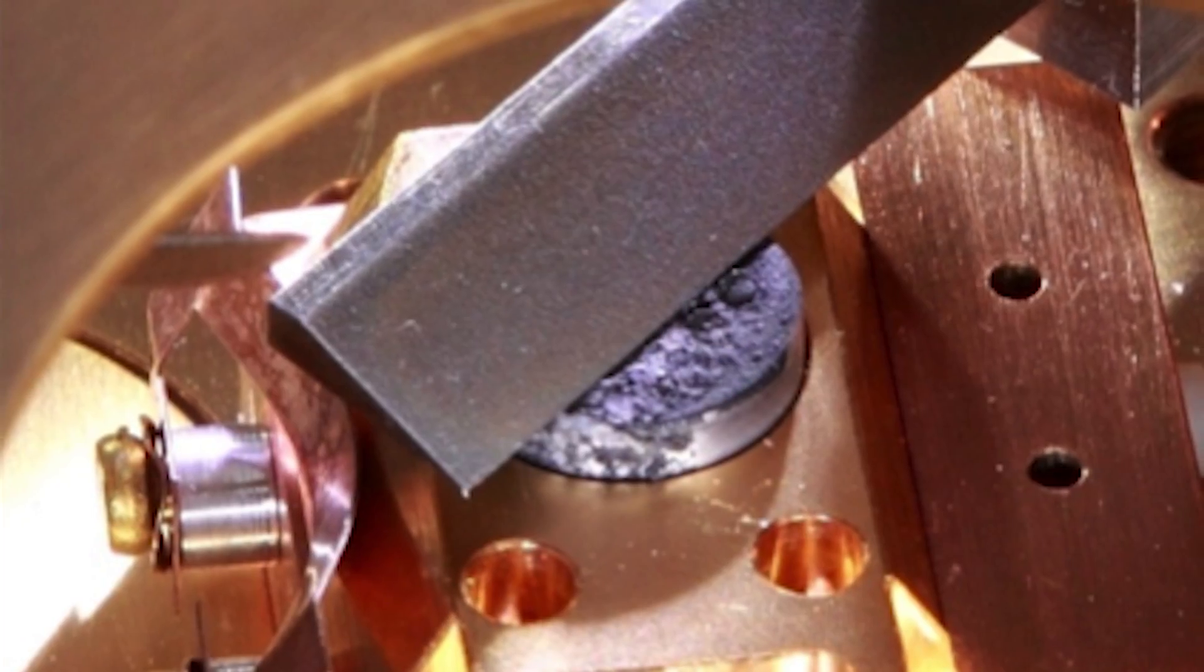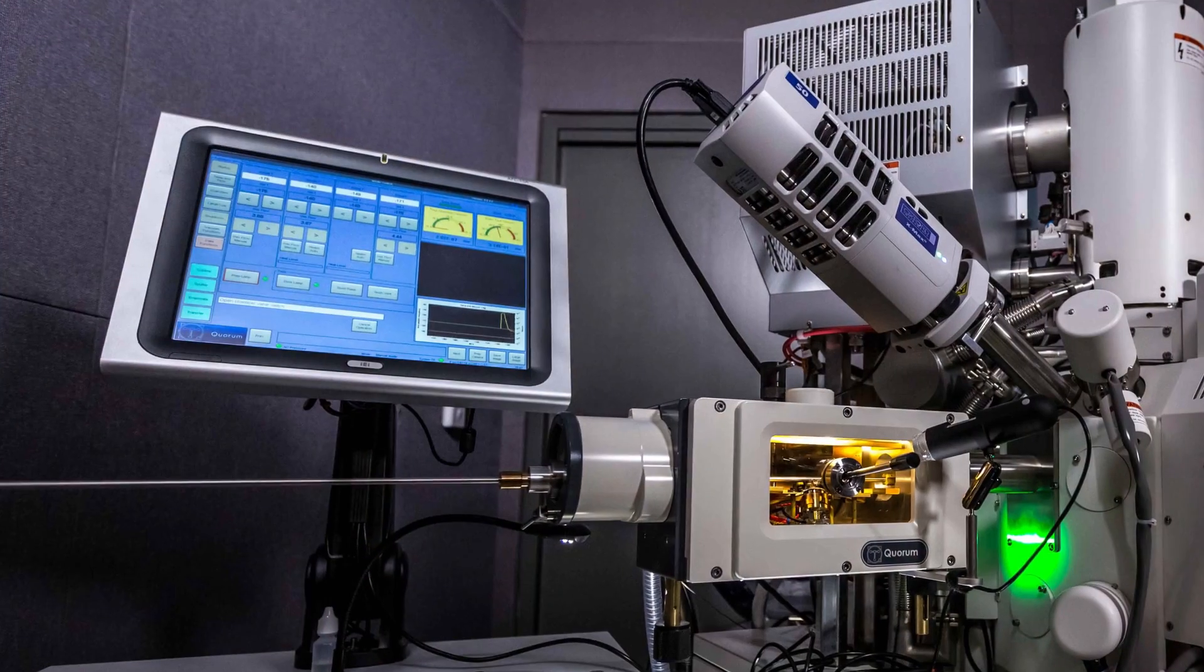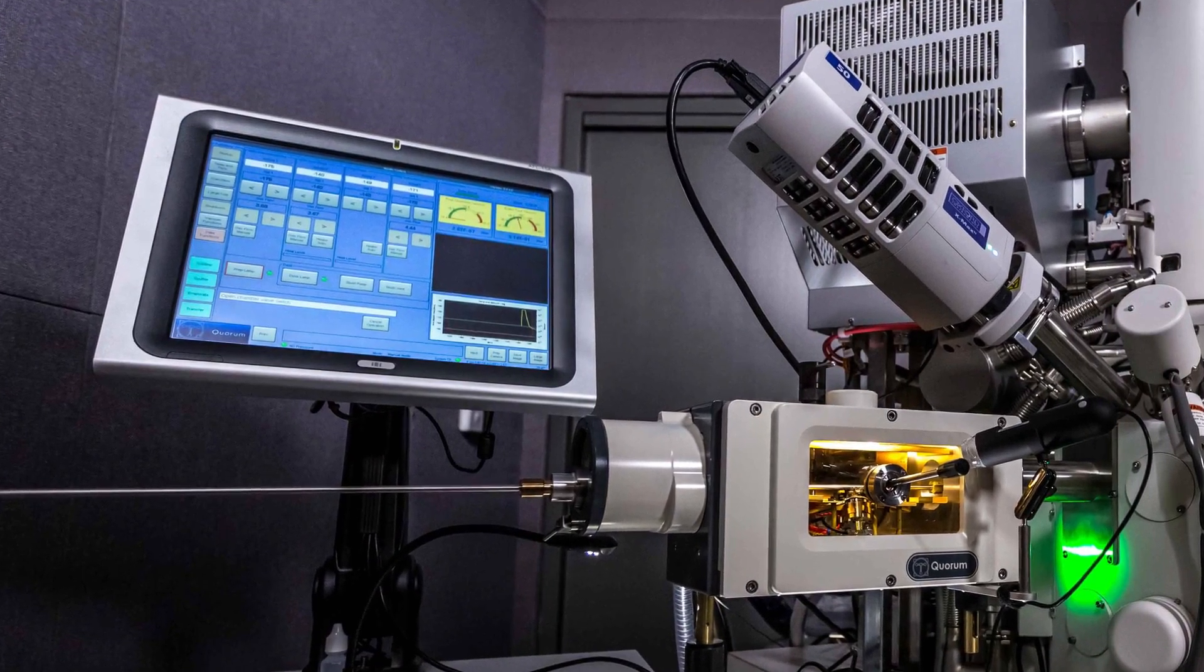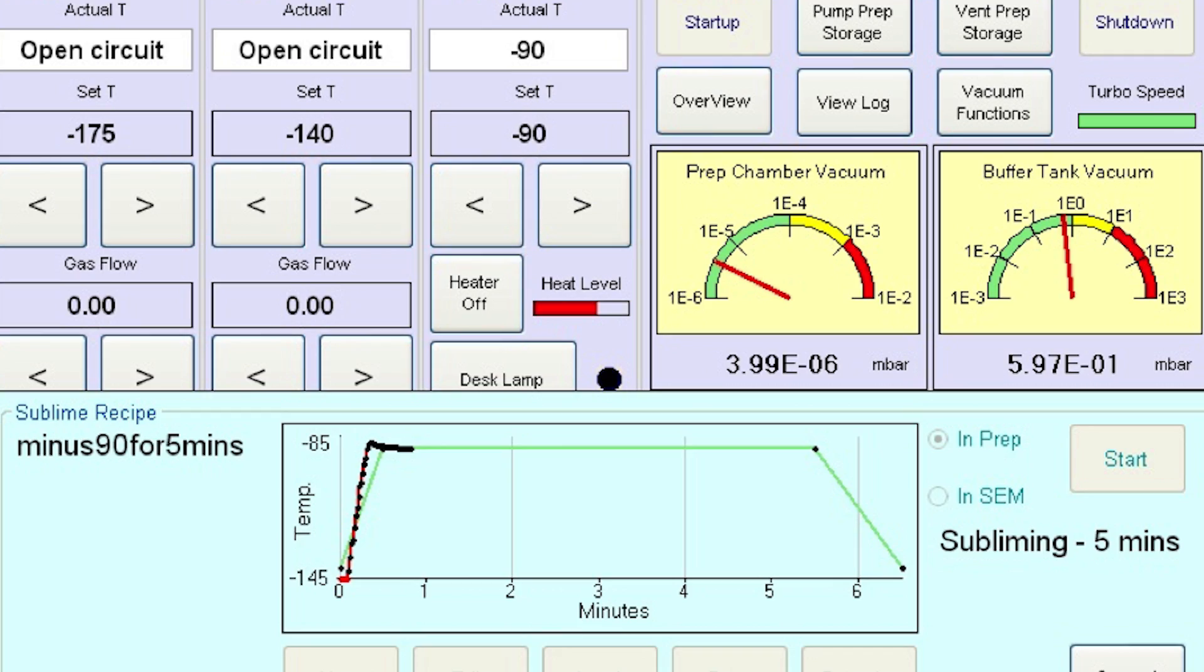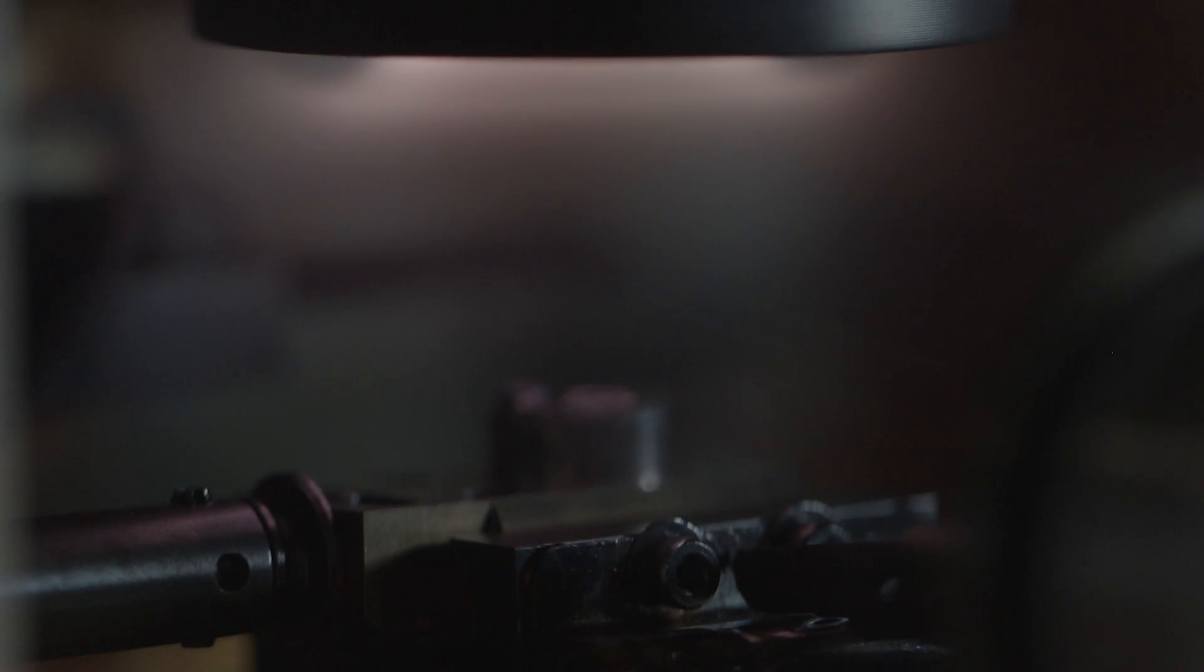Multiple preparation functions are integrated in the Quorum system such as fracturing specimens, sublimation or etching to reveal greater detail along the surface or within the sample, as well as coating with metal by sputtering or with carbon by thermal evaporation.